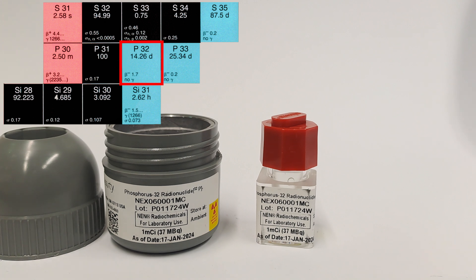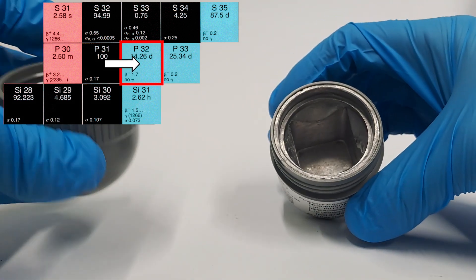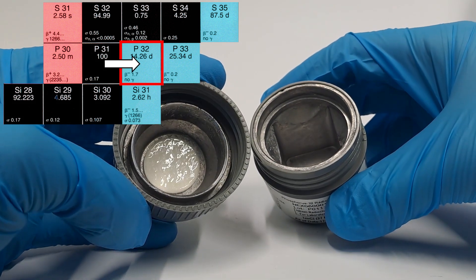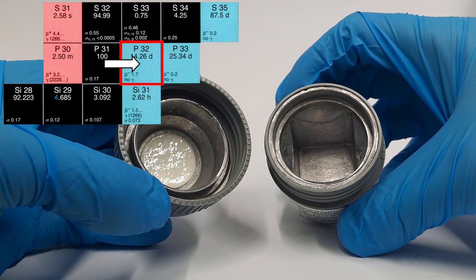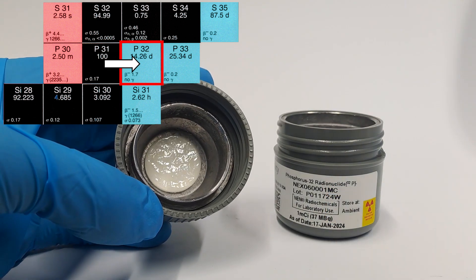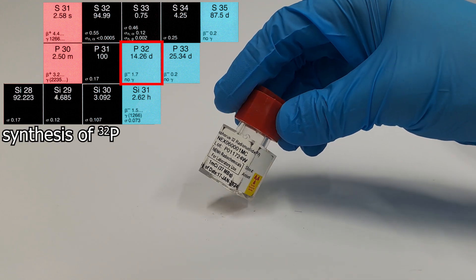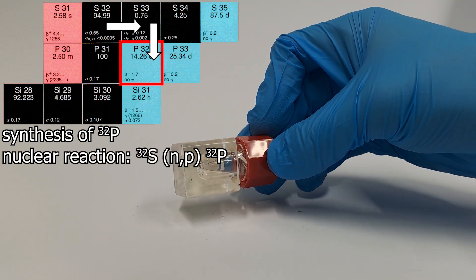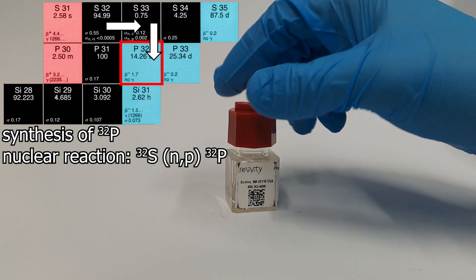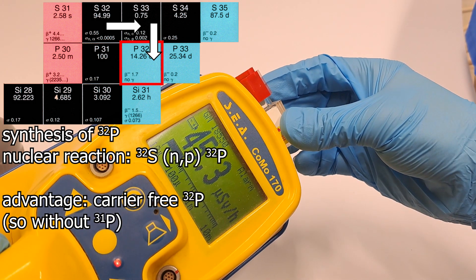The radionuclide used here is carrier-free phosphorus-32. You might think that phosphorus-32 is produced through a simple N-gamma reaction in a reactor by neutron irradiation of natural phosphorus. However, that is not the case because you wouldn't convert all of the phosphorus-31, leaving you with a mixture. If you want pure phosphorus-32, as we have here, it is produced through an N-P reaction with sulfur. Sulfur-32 is converted into phosphorus-32 and due to the different chemistry, pure phosphorus-32 is obtained, which can be used for research.